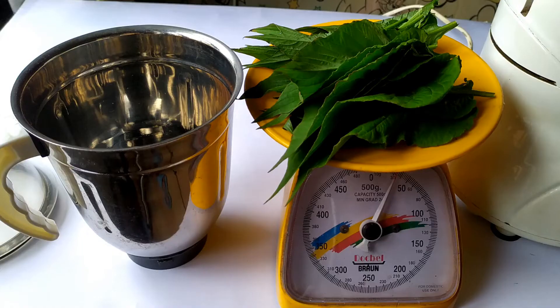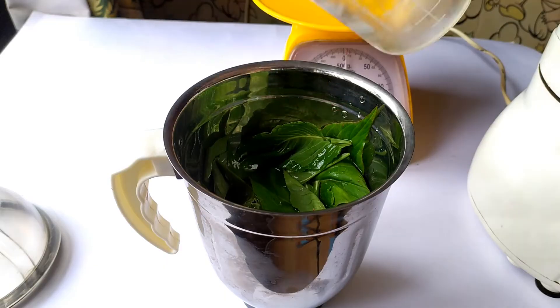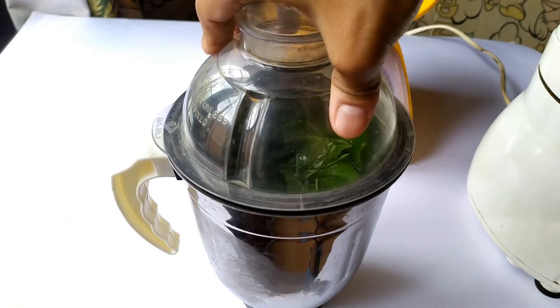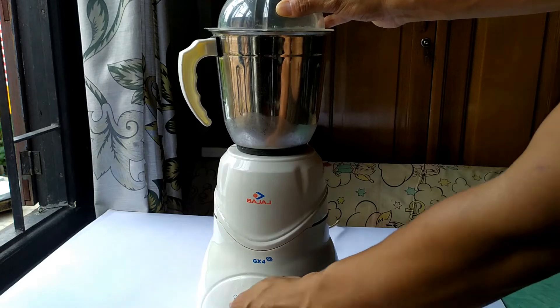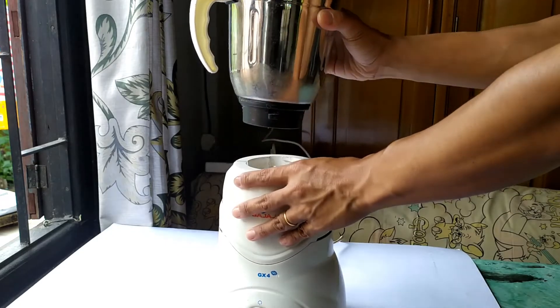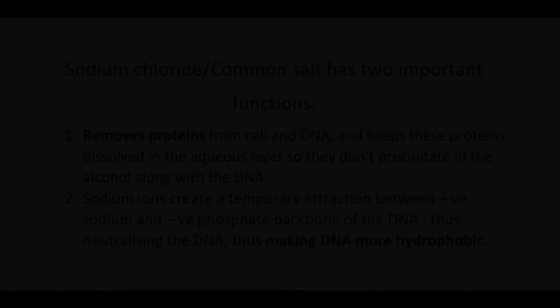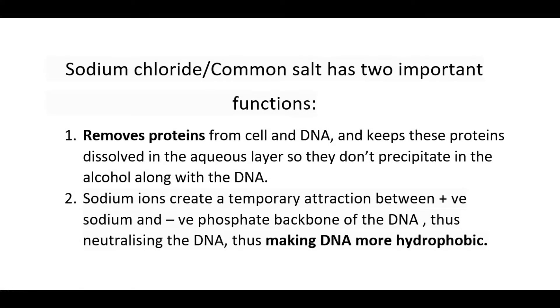To begin the experiment, weigh 50 to 100 grams of the plant material, transfer it into a pestle and mortar or blender and blend it with about 100 ml of ice cold water and half a teaspoon of common salt — sodium chloride. Sodium chloride helps to remove proteins that are found within the cell and also bound to the DNA. It also helps to keep the proteins dissolved in the aqueous layer so they don't precipitate in the alcohol along with the DNA in the later part of this experiment.